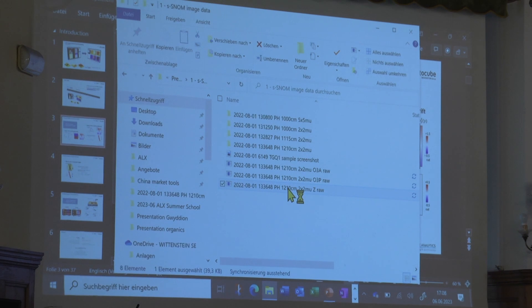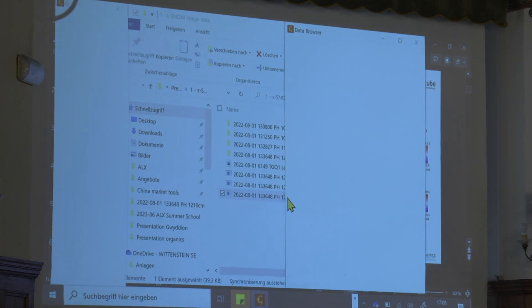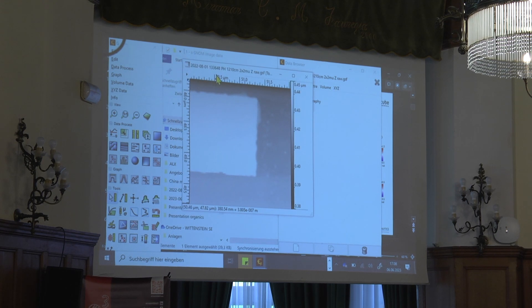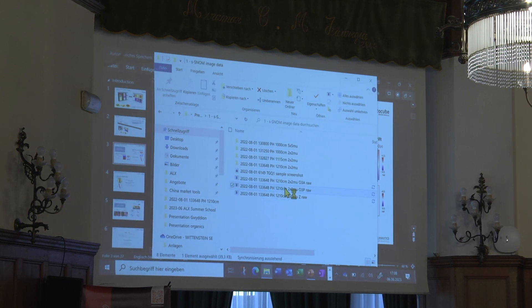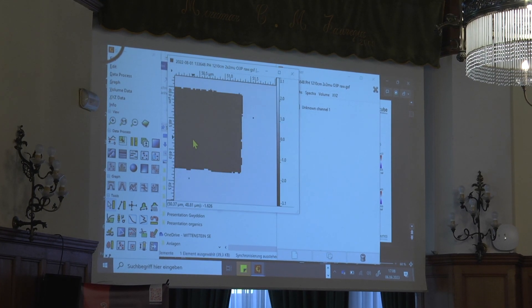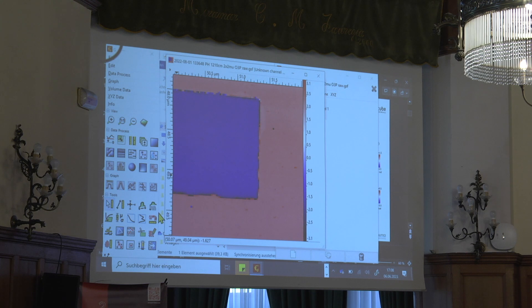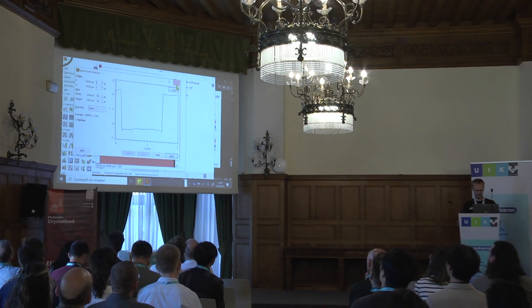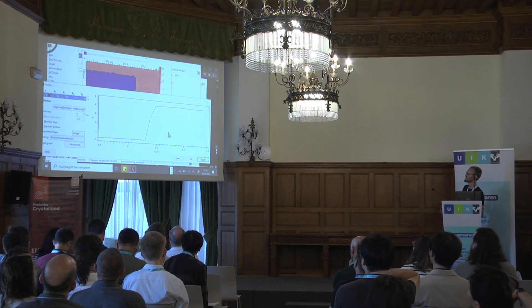I have brought the data example here. Let me first plot the topography so you know what this data looks like. We have here a topography image — it's just a white square. This is a silicon dioxide square on the silicon substrate. We're looking at the optical phase. We can see there's a really strong contrast and it's really abrupt. If we make a line profile from the blue area to the red, we can see a super sharp jump — from roughly minus two to plus three, that's around two pi.